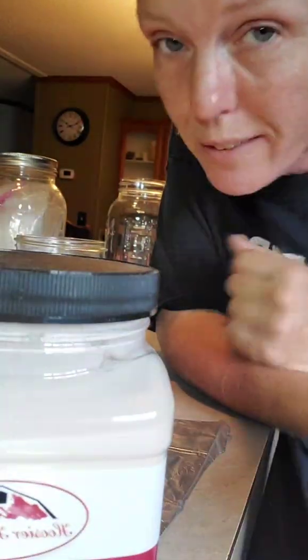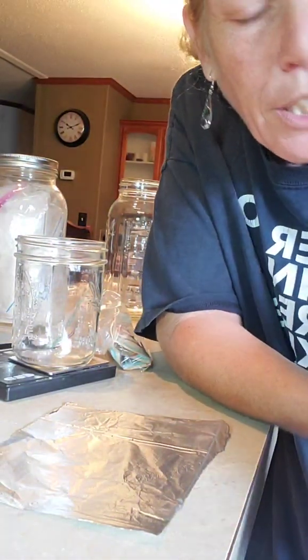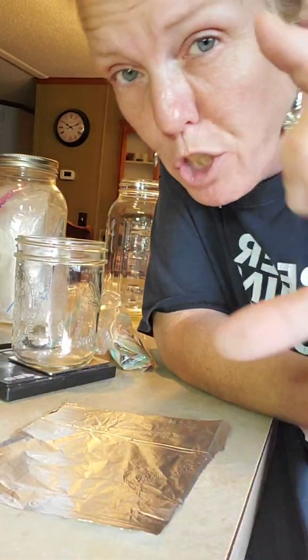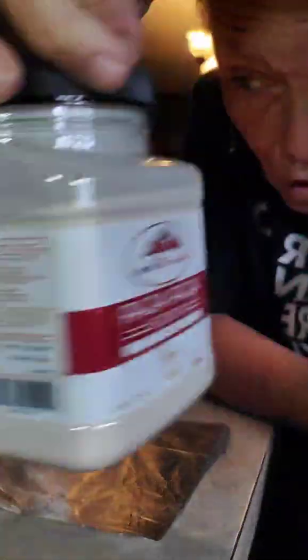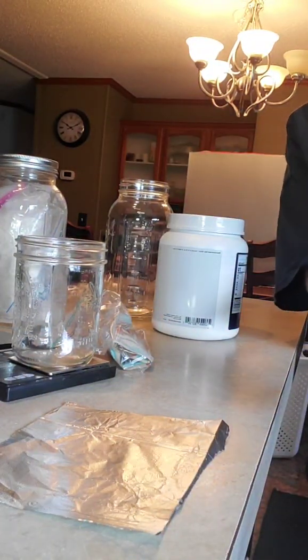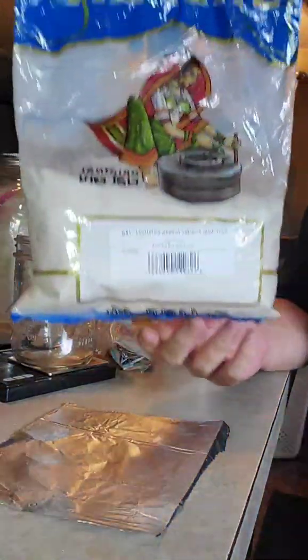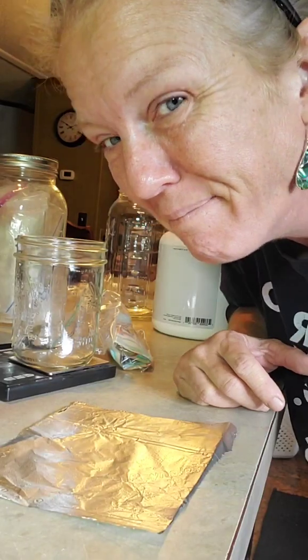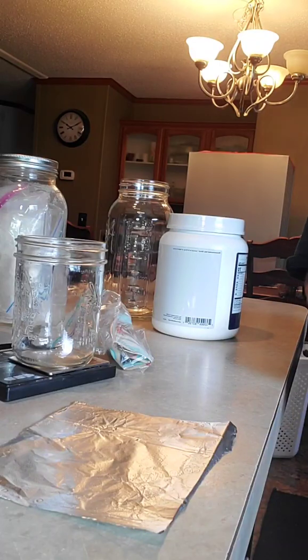That's all it is. Just the agar. Most of them, they don't have the nutrients in them. You still have to add the nutrients. So I would never pay $32 for a thing of agar powder that big when this thing cost me $12. And this gigantic monster, this is from India. This giant monster of a bag was $15. I've had this bag for 3 years. That's how little agar you use. The nutrients are what you use a lot of.